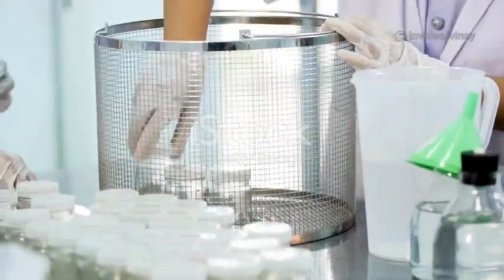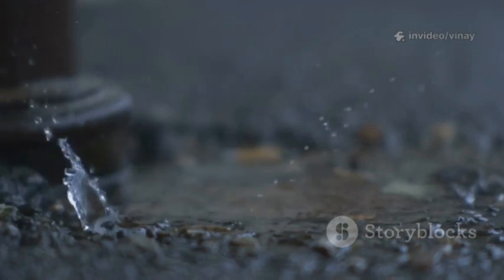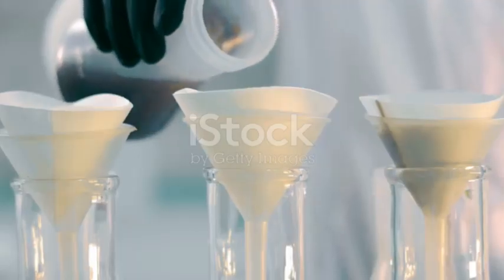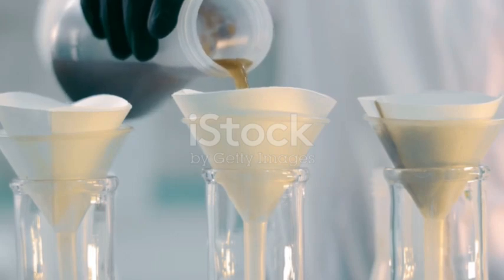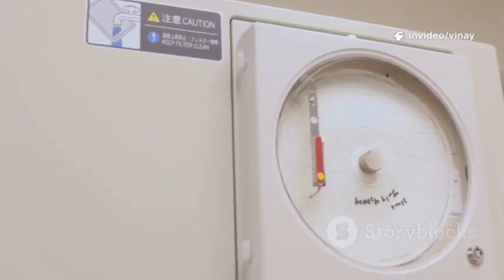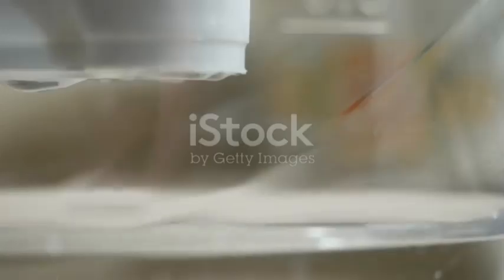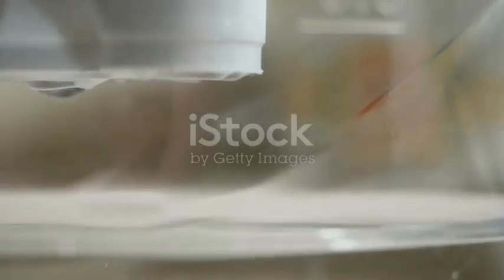Now let's talk about a special kind of filter and a special kind of test. Some filters are hydrophobic, which basically means they are water-fearing. If you try to push water through a dry hydrophobic filter, the water is just repelled by the filter material. It won't wet the membrane easily. These filters are super useful for applications like sterile venting, where you want air to pass through freely, but need to block any water droplets or airborne bacteria.